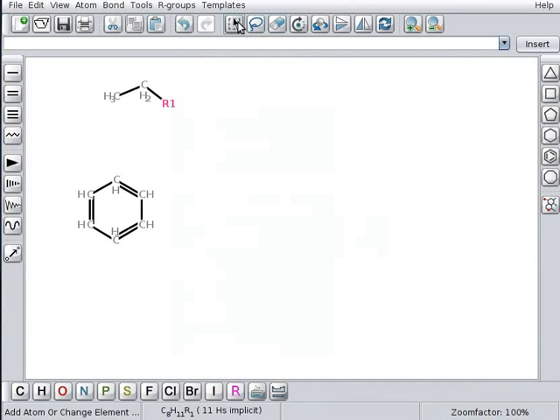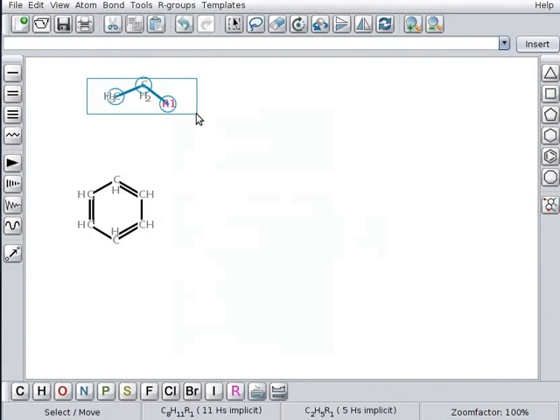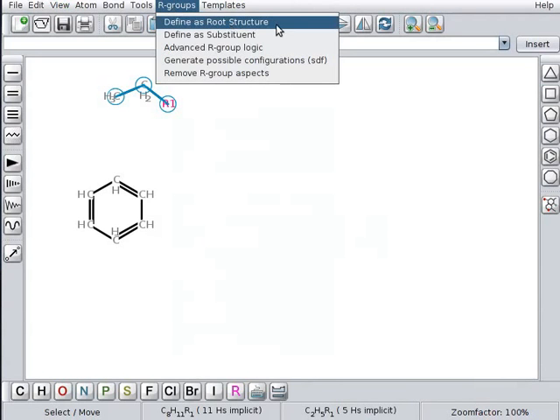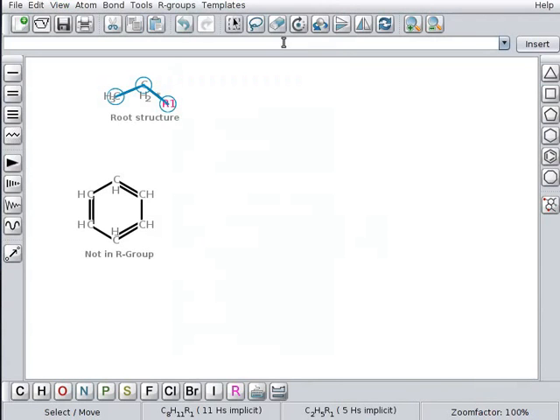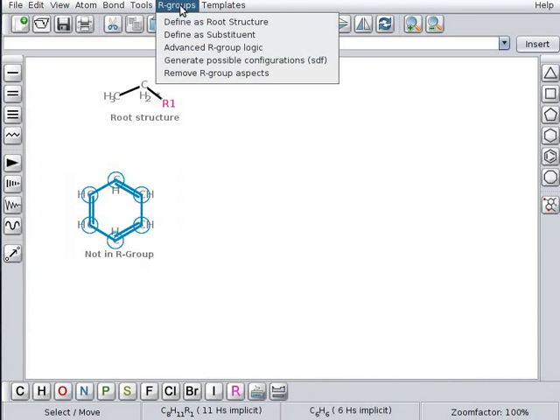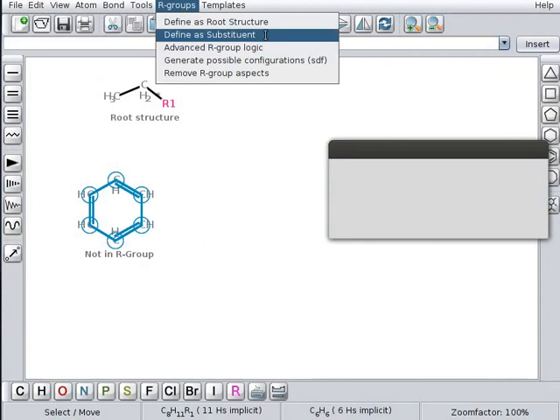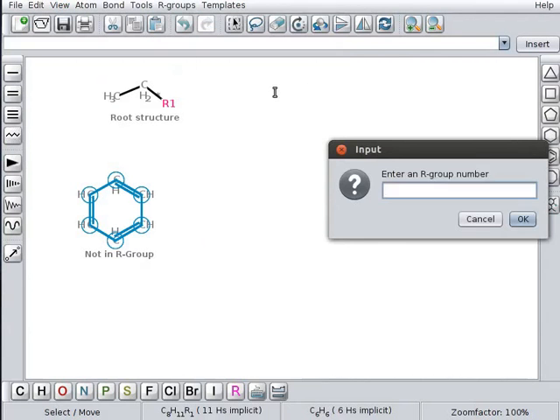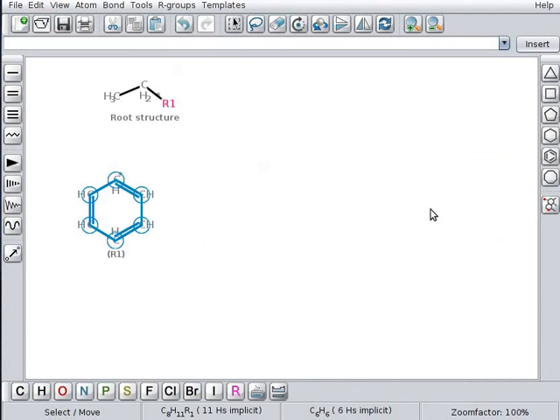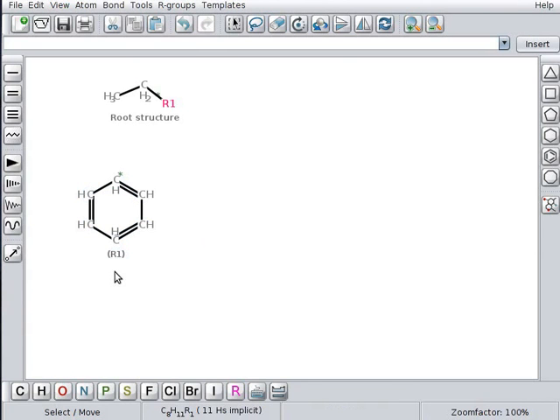Click on selection button. Select the root structure by dragging over it. Go to R groups menu and select define as root structure. The substituent structure will be added as not in R group. Click on selection button. Select the substituent. Go to R groups menu and select define as substituent. An input box opens. Here enter R group number as 1 and click on OK button. The substituent will be numbered as R1. On the root structure, the substituent R1 will be marked with an asterisk.